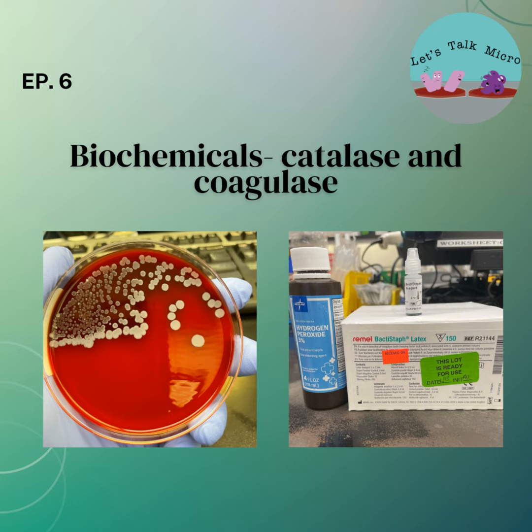These biochemicals, like I said, work because bacteria produce certain enzymes, and when you add a biochemical, it causes a reaction you can observe, like agglutination or a color change. It's very important and definitely helps in identifying your bacteria.